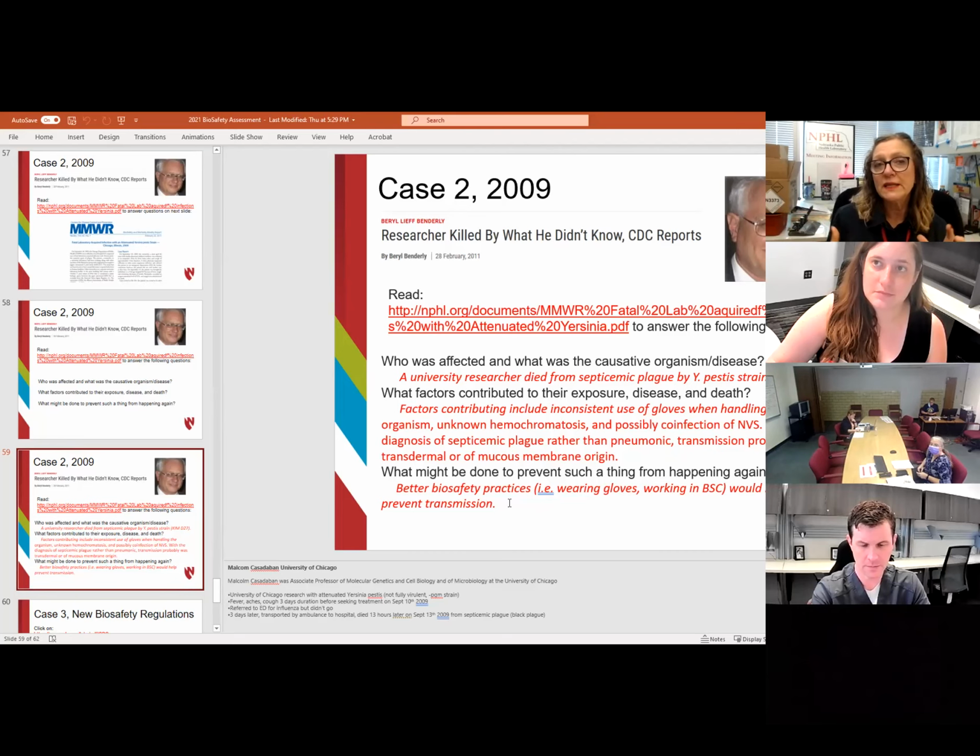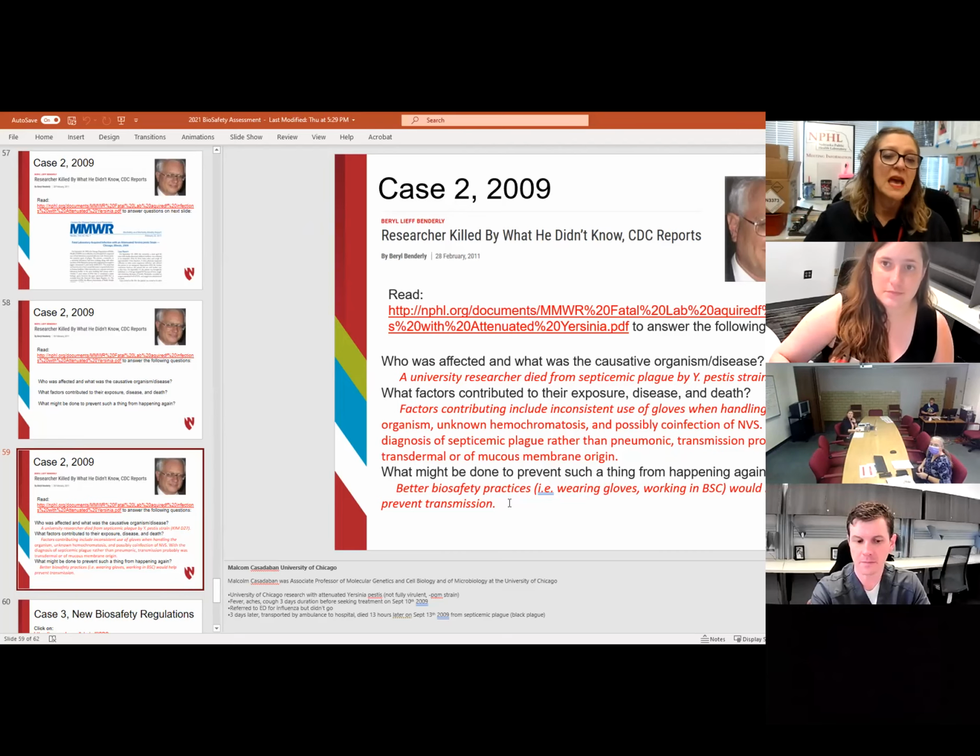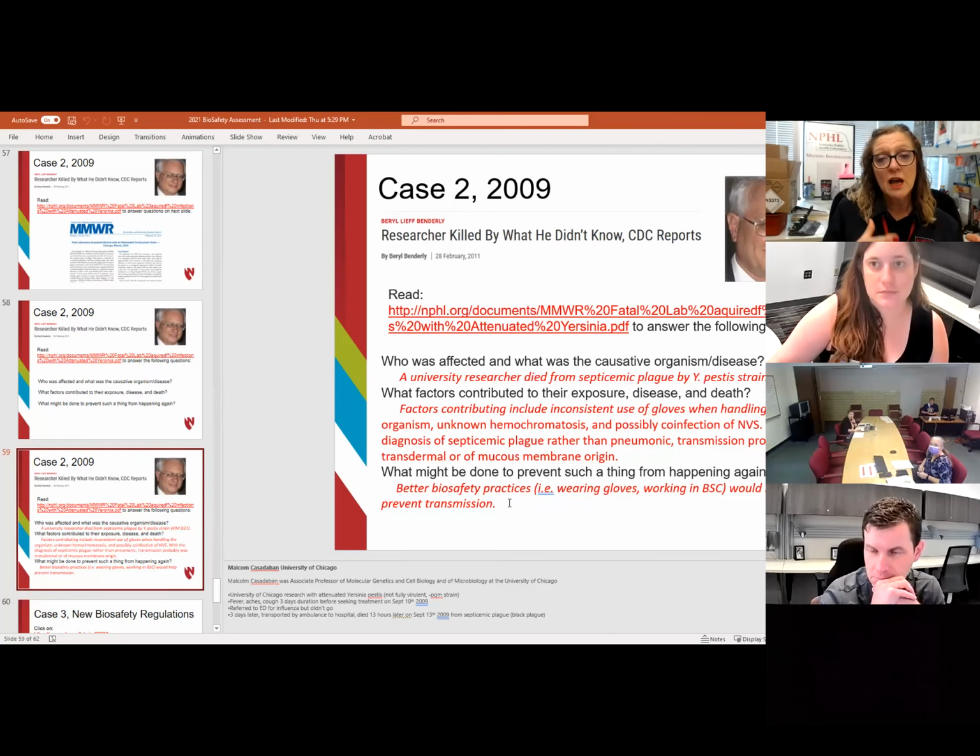There's other things safety-wise that we kind of talked about in the slides beforehand. If you have a really tight, small lab, if you've got people walking as close as 5 feet behind you, believe it or not, their walking can be faster than the airflow that's happening in that biosafety cabin.